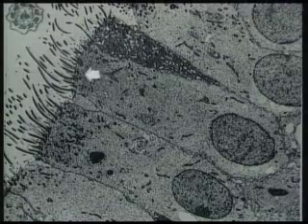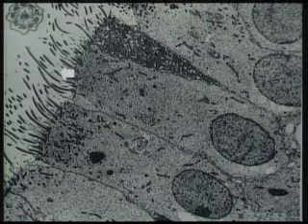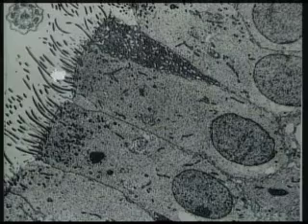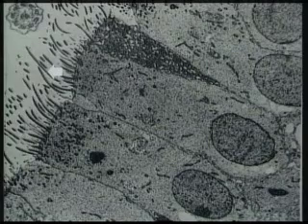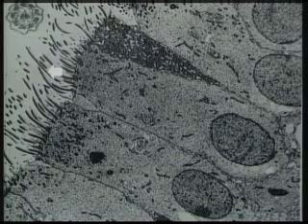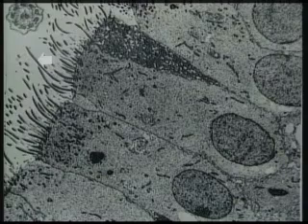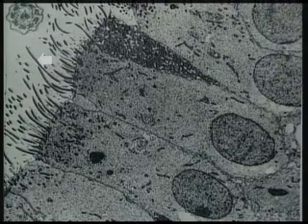Although cilia can be somewhat difficult to resolve on an individual basis with the light microscope, they're very easy to see in the electron microscope. These are several ciliated cells from the epithelium lining the human nose here. This is the surface of the cells, and from the cell surface extend these cell surface specializations, the cilia, here, and each cell has a large number of them. The ciliary shaft, as I mentioned, is 2/10 of a micrometer in diameter, and it's very easy to see electron microscopically. When you look at it in cross-section, the ciliary shaft has a very specific ultrastructure.